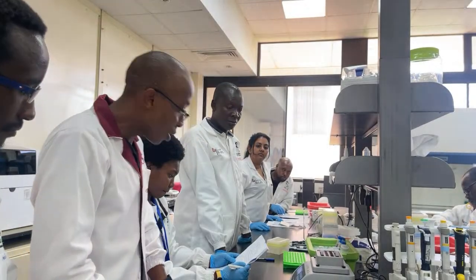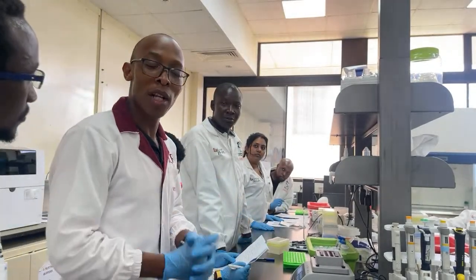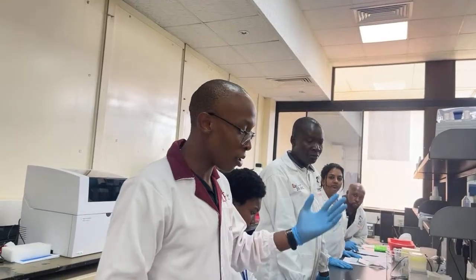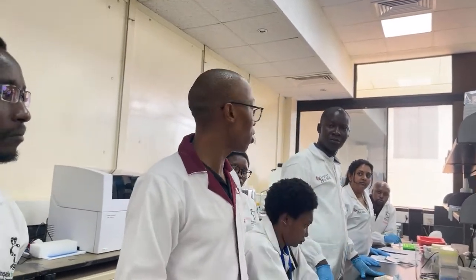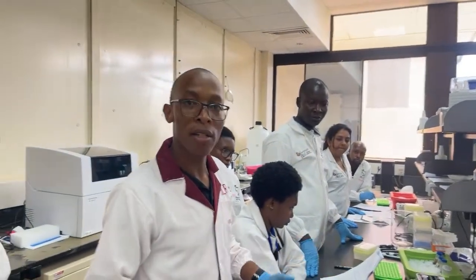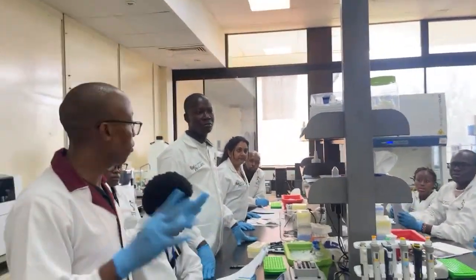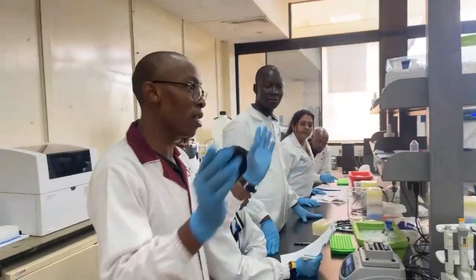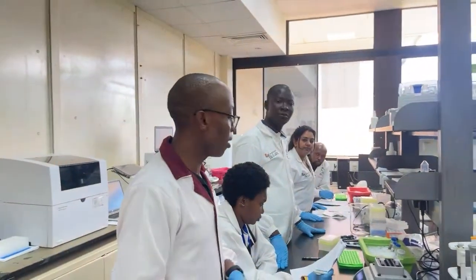All right, it's another waiting time, unfortunately. So for the people attending online, you can ask any other questions. We have a 25 minute incubation step, and you can also ask anything outside of this practical. It could be the technology, anything that you want to understand about PacBio HiFi sequencing. Even for the people in the room. If you have a question about the core technology, not just what we are doing now, you can ask now. So everything is open floor question time, for those online and for you guys here.